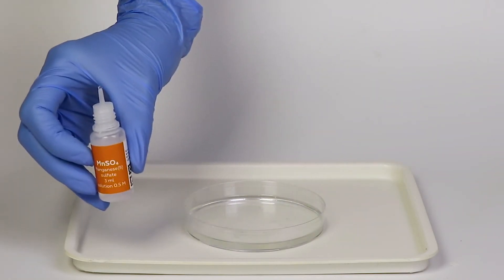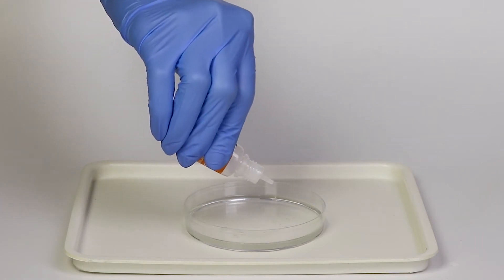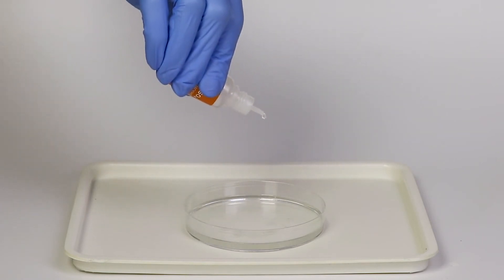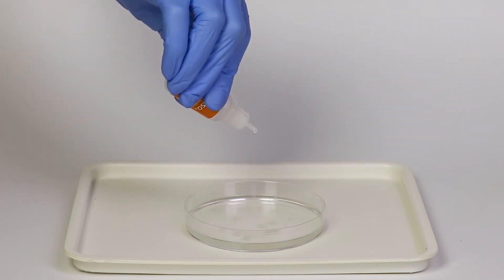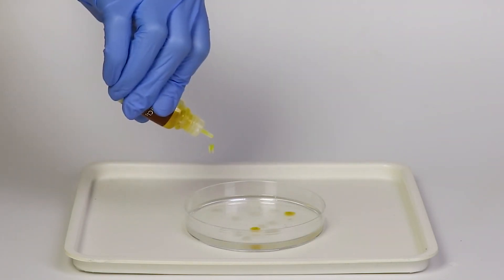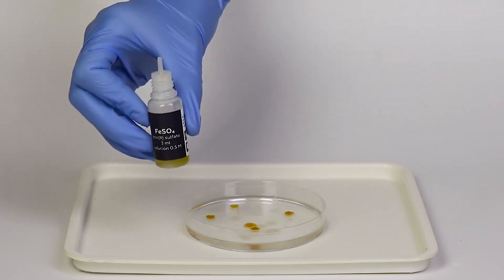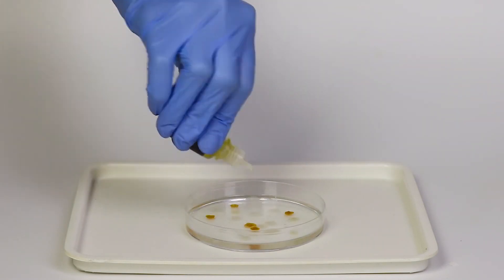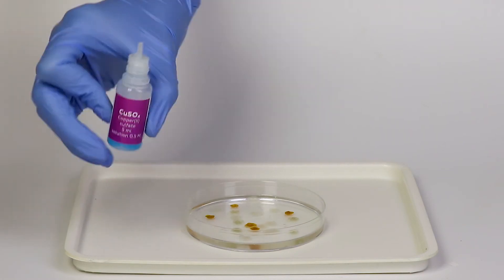Now take the manganese sulfate solution and add six to ten individual drops from various heights and in different places on the petri dish. Repeat with the solutions of ferric chloride, ferrous sulfate and copper sulfate.